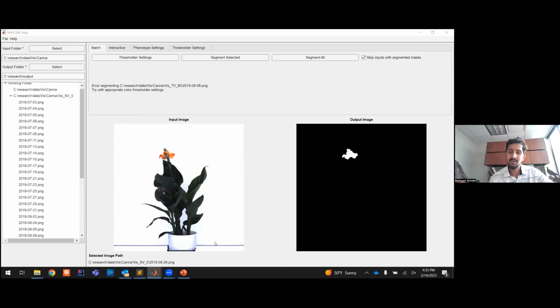Scale conversion can be included pretty easily, but in order to set up the scale, it really requires user intervention, because every image is shot at a different scale, and it really depends on the image. It's just a mathematical formula that could be applied or multiplied, but it depends on what the scale is.